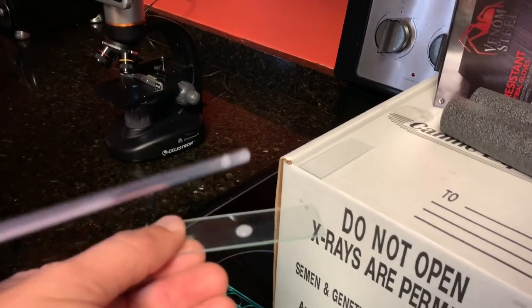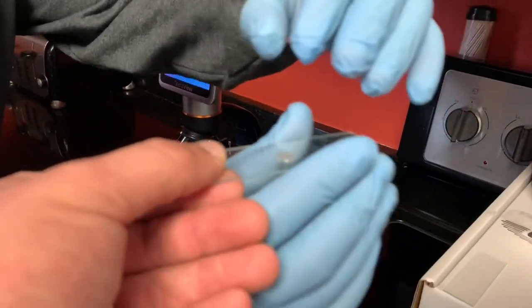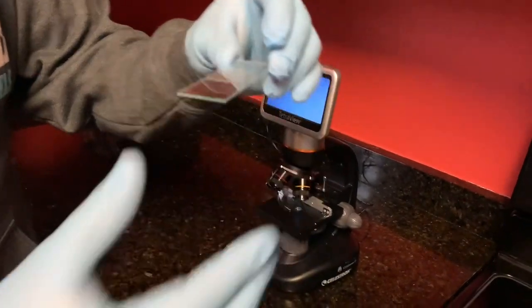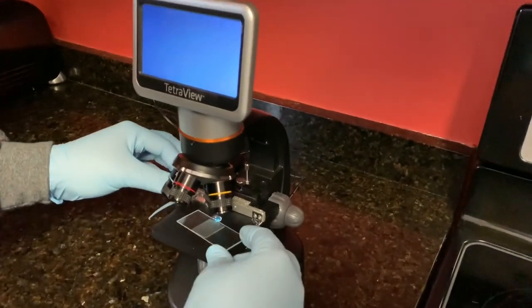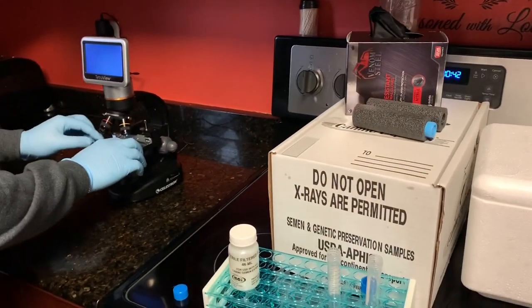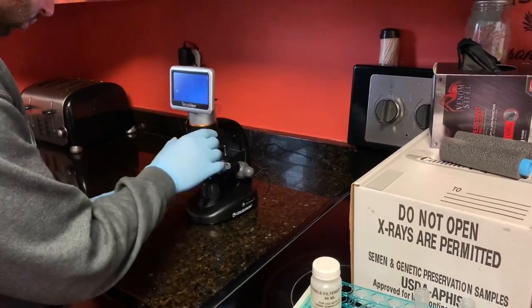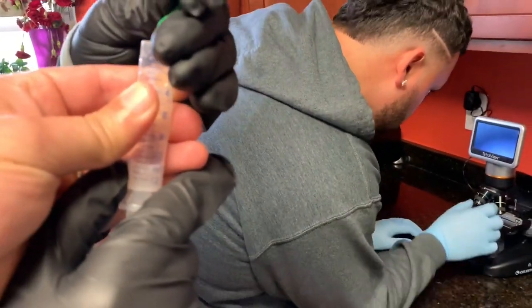That's way more than we need, but what we're gonna do is put this slide on here so that you guys can actually see what the semen looks like before we send it out. Louis will slide that underneath there. In the meantime, Justin, go ahead and pull that semen back for me. See if you can get as much of that in there as you can. There we go. And whatever you can't get in, just take the straw off. We don't need it. We're not even using this.